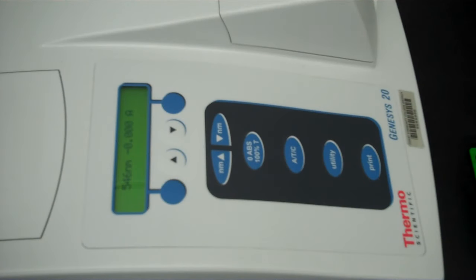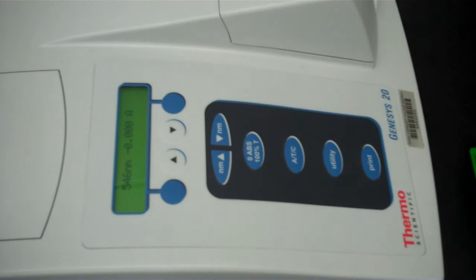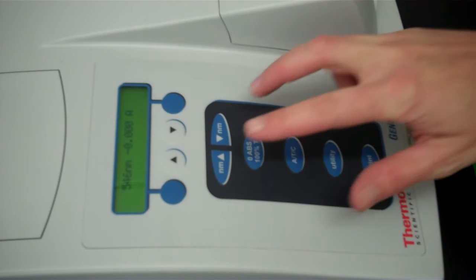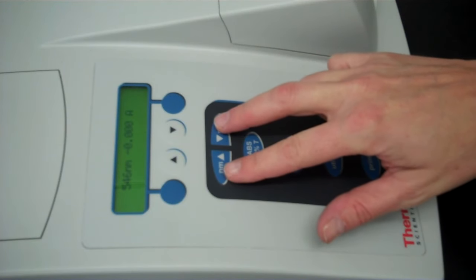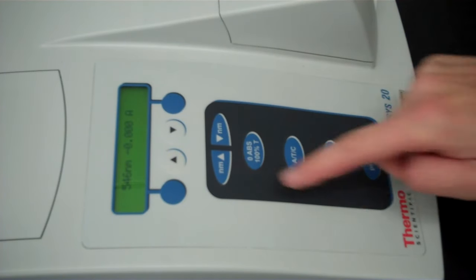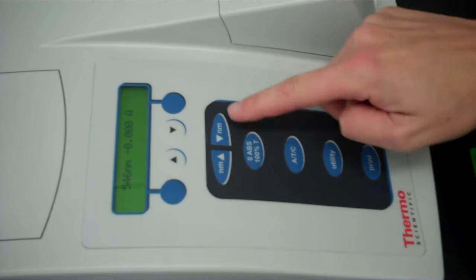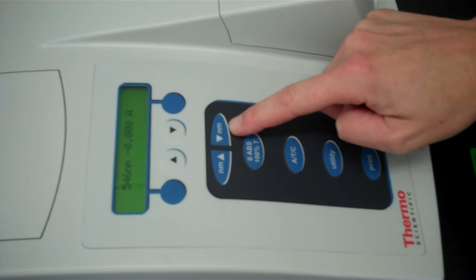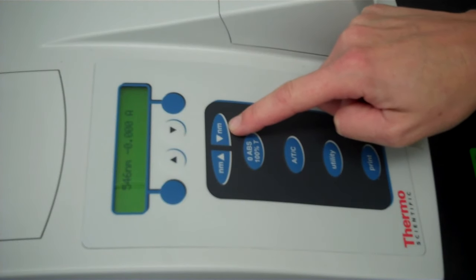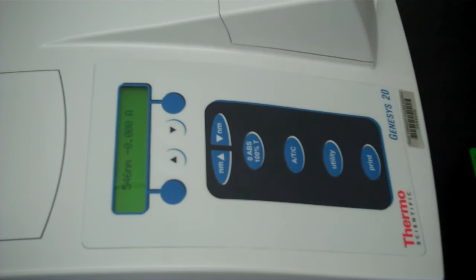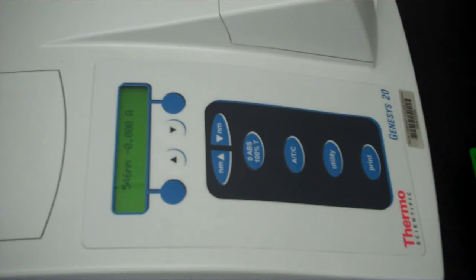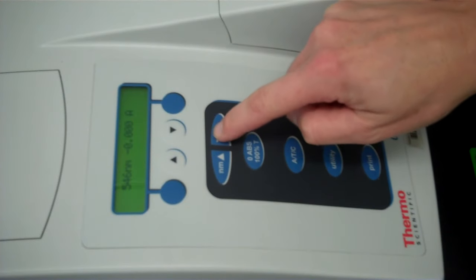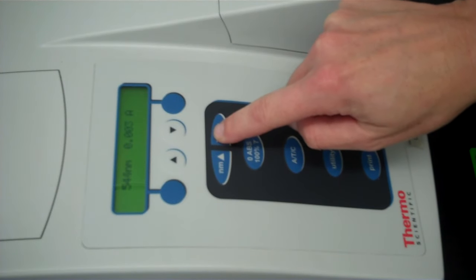Once it is initialized it is time to set the wavelength that you're going to be using and to blank the machine. In order to set the wavelength you use these two buttons here that say NM arrow up or NM arrow down. For this demonstration I'm going to set the spectrophotometer to 540 nanometers by pressing on the NM down.